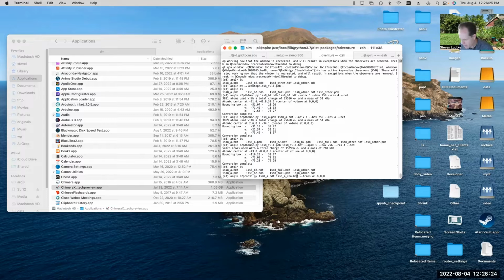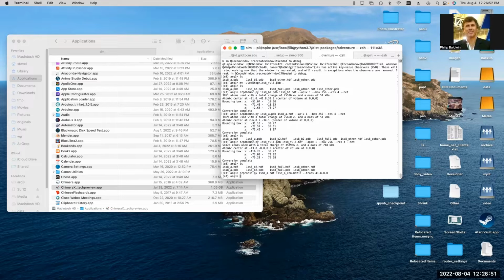The other thing I'm going to do here, and I didn't do this when I was running the PDB to MRC, is specify how many bits to use in the representation for the file. I'm going to tell it to use only an 8-bit representation. This is using the new syntax that we just added after the compression paper was published. If you put a :8 at the end, it won't be part of the file name, but it will only preserve 8 bits of information in the signal part of the data. We'll take a look at it in a second. Let me go ahead and do it for the other ones, and then I'll show you what I mean.